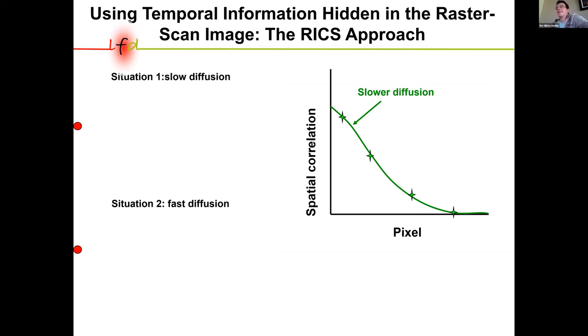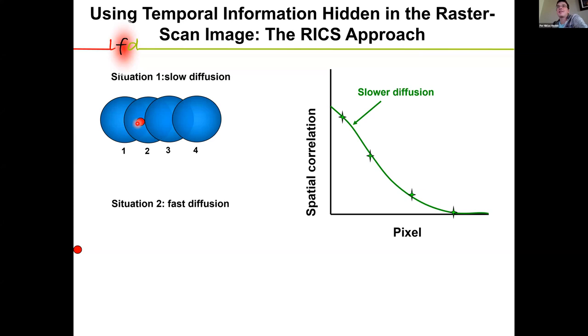So how can we get some information about the movement of molecules? Well, consider that you start scanning your image. Consider this the red point here on the left corner of the screen. And let's consider we also have a molecule in that spot at the time we start scanning. Now if we have slow diffusion, the molecule is able to follow or move the same way as the laser beam. There's a statistical chance for this happening.